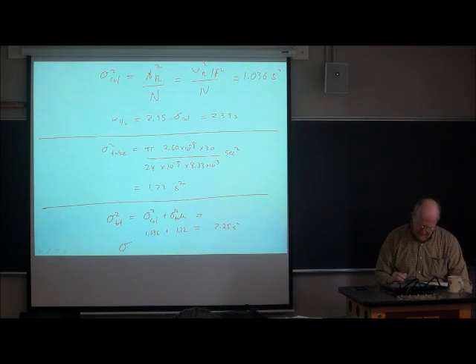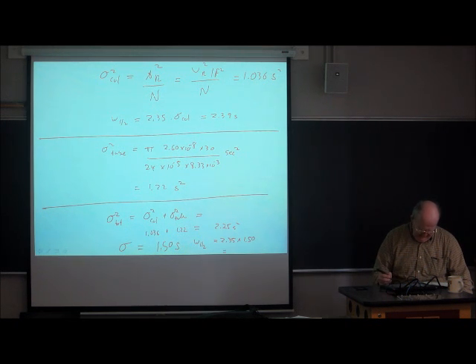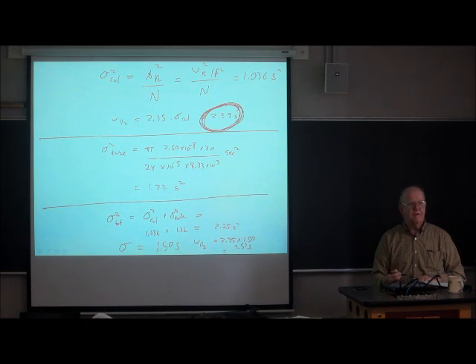And the corresponding sigma is the square root of that, which is 1.50 seconds. The width in seconds then is going to be that times 2.35, which works out to be 3.52. So look at this. If you didn't have any connecting tubing, the width of the peak would appear to be 2.39 seconds.